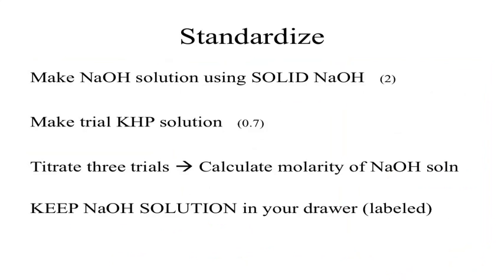How much solid sodium hydroxide are you supposed to measure out? What's that? 2 grams. 2 grams. Does that look suspicious? Oh, 2 grams. I get the same answer. You need to measure out 2 grams. They are measured out as solid pellets. Getting an exact 2 gram amount is approximate. So we don't care that you get exactly 2. We want approximately 2. Okay?